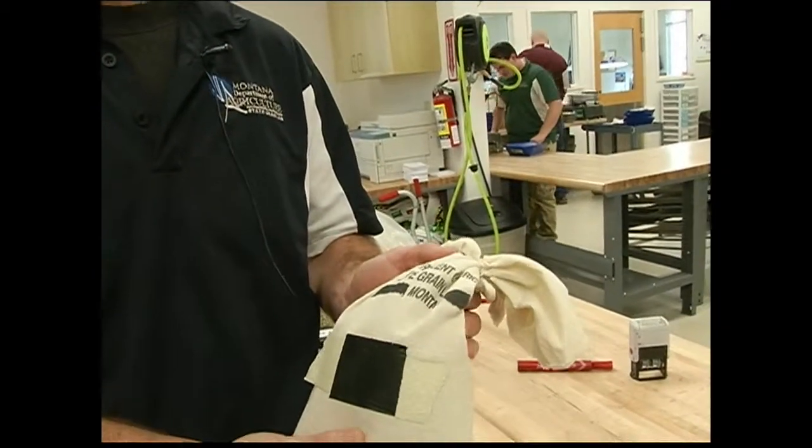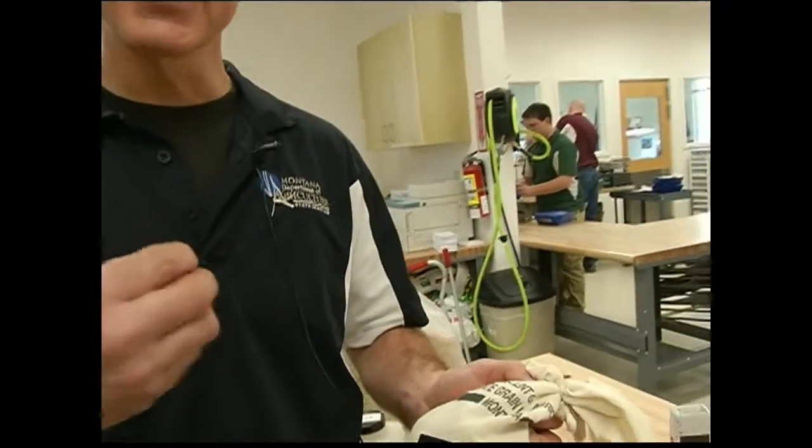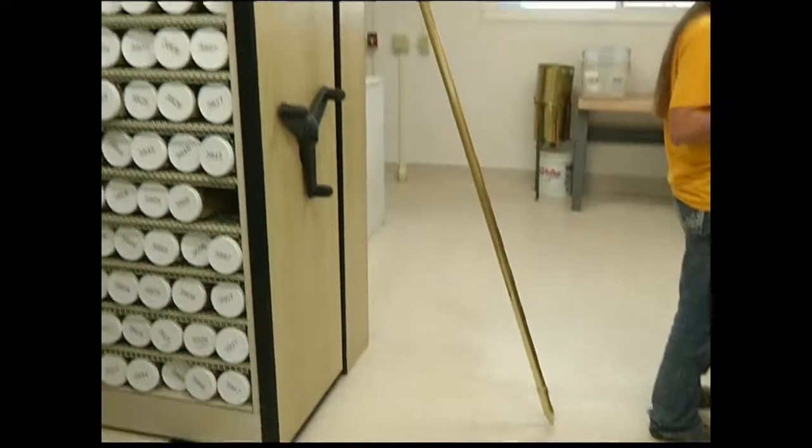Grain samples basically come to our lab 3 different ways. Many samples come to us by the producer. They will take what they call bin samples, and they'll physically drive to our lab and drop off their samples themselves. The other way that samples come to us is the elevators send samples here on the farmer's behalf. So as grain is being delivered to an elevator, those grain trucks are probed, those samples are collected, and then every morning the delivery service shuttles those samples from elevators and they arrive here. The third way that we get samples is where we physically go out and sample off of a rail car or out of a warehouse.